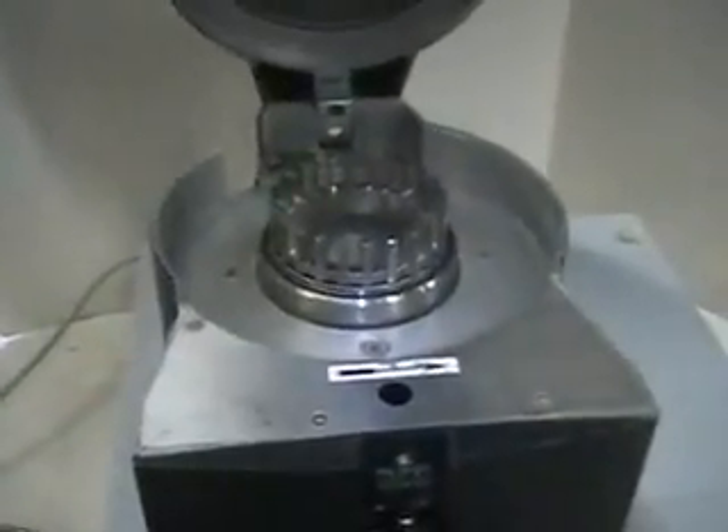This is the tray everything collects in. When this unit is powered on, every time you power it on and off, you have to take the tray out and put it back in.